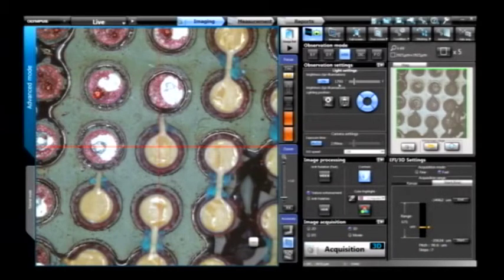We have a new feature unique to this tool called Mix. This allows us to use dark field lighting — still with our segmented LED — while incorporating bright field observation at the same time. You can adjust the bright field as needed, making it brighter or darker to get your background image that dark field usually cuts out, while still getting all the edge enhancements of dark field.